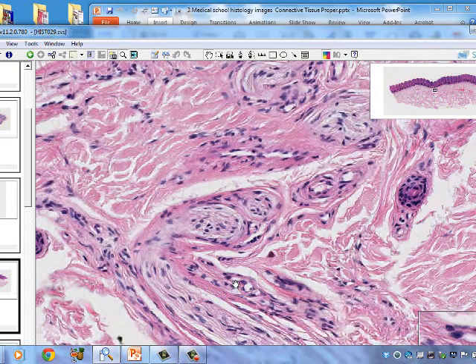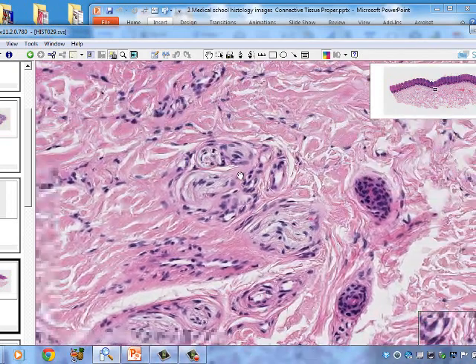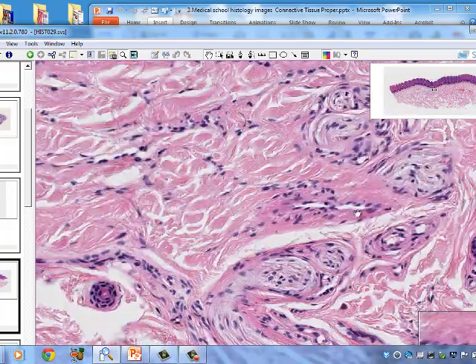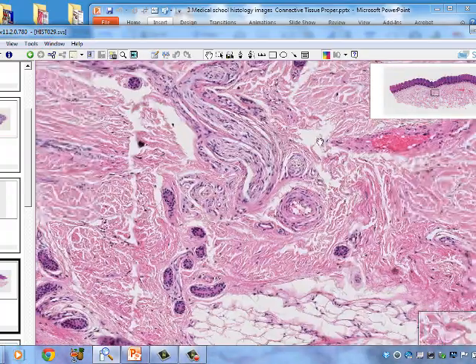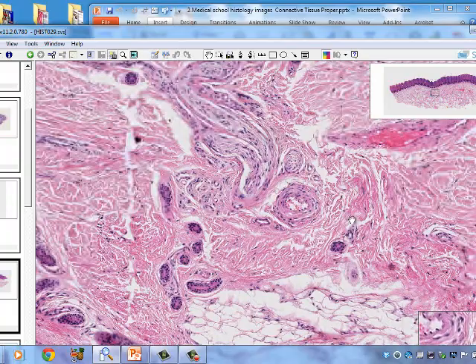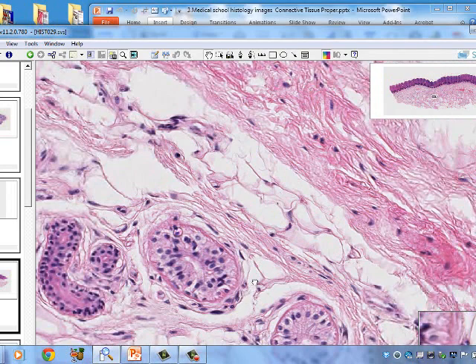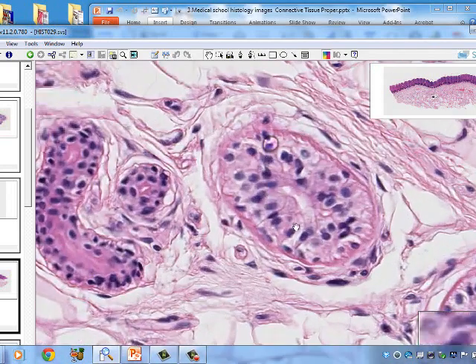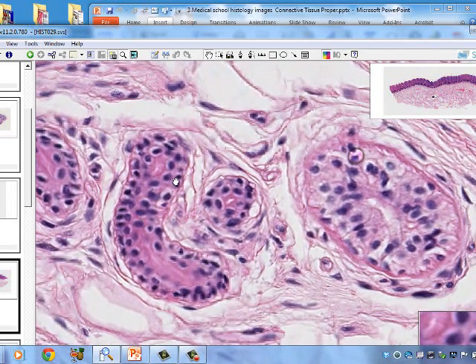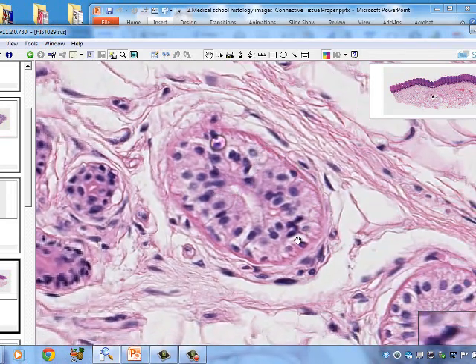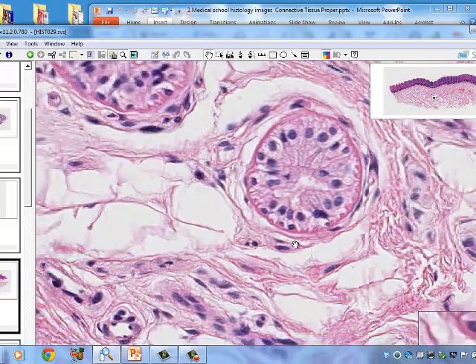Collagen bundles surround the perineurium of the nerve. Also visible are sweat ducts, a small artery, and more sweat ducts — with their eosinophilic secretory portions being larger than the duct portions. The duct has stratified cuboidal epithelium, and the pink cells around the secretory portion are myoepithelium.